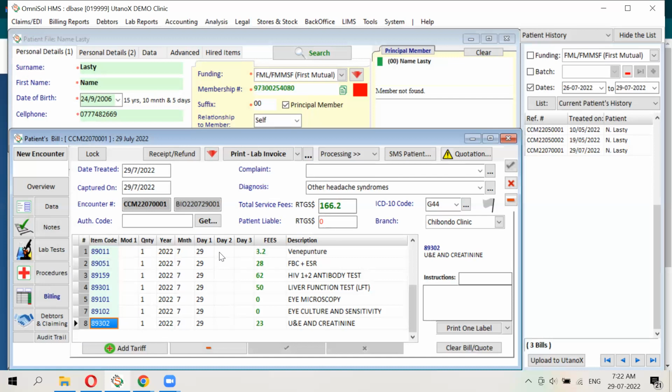Because I'm looking at a scenario where I have requested liver function tests, and then 1 or 2 parameters, like I gave an example that for the bilirubin the sample was hemolyzed, but the person who did the request is probably the front office staff who is not really well versed with which sample is adequate for processing or not, but they are probably just using the forms. Perfect. Then by the time the sample gets into the lab, they realize that it's too hemolyzed for them to do the bilirubins. Then they don't do the bilirubins and they don't generate results for that. They do the other things.